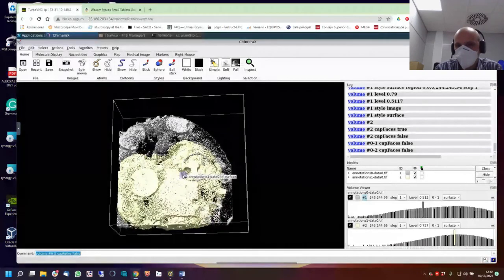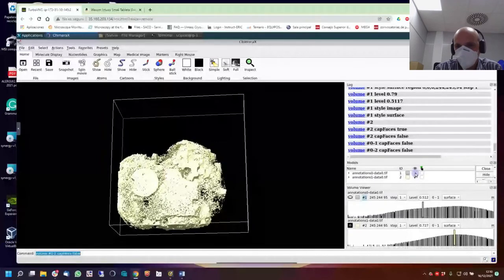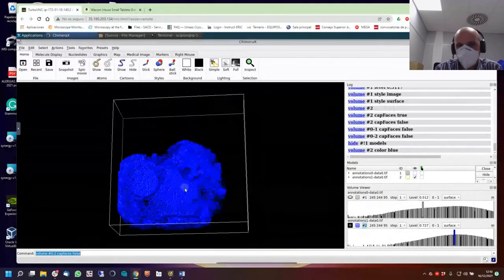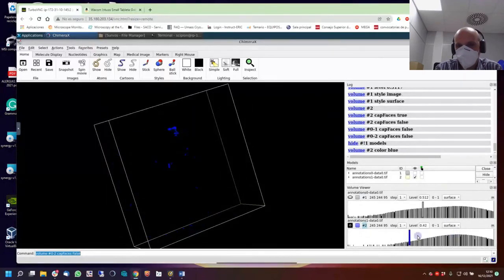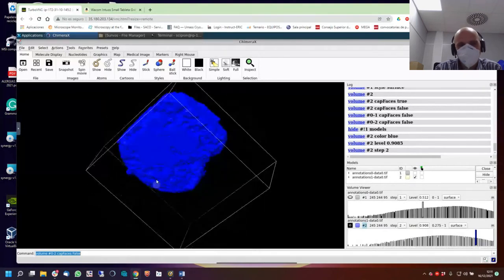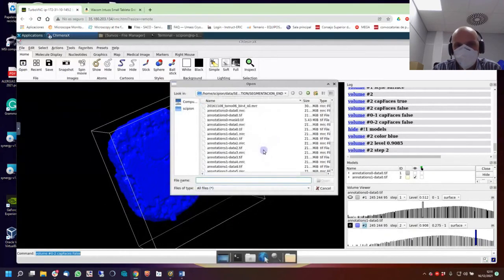Okay, and now we're going to see the nucleus, and if we click here, we get it in blue. Okay. And that's the nucleus. So we can go farther and lower, and in order to make it smooth, you can go for this. Okay. And that's the nucleus of the cell. Okay, again, open. You can go for the second one. 1 open.